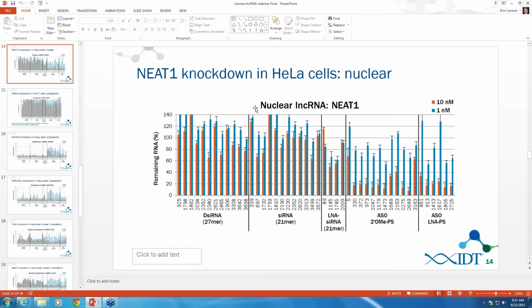We see antisense activity basically will be consistent. For these armored antisense oligos, meaning they're not easily degraded by nucleases, we'll see activity until the cell divides enough that it dilutes out the antisense oligo. And the same thing is for a good RNAi reagent. For a Dicer substrate, we'll see knockdown for up to 5 days. So yes, you can pre-treat your cells before you induce expression of your long non-coding RNA.